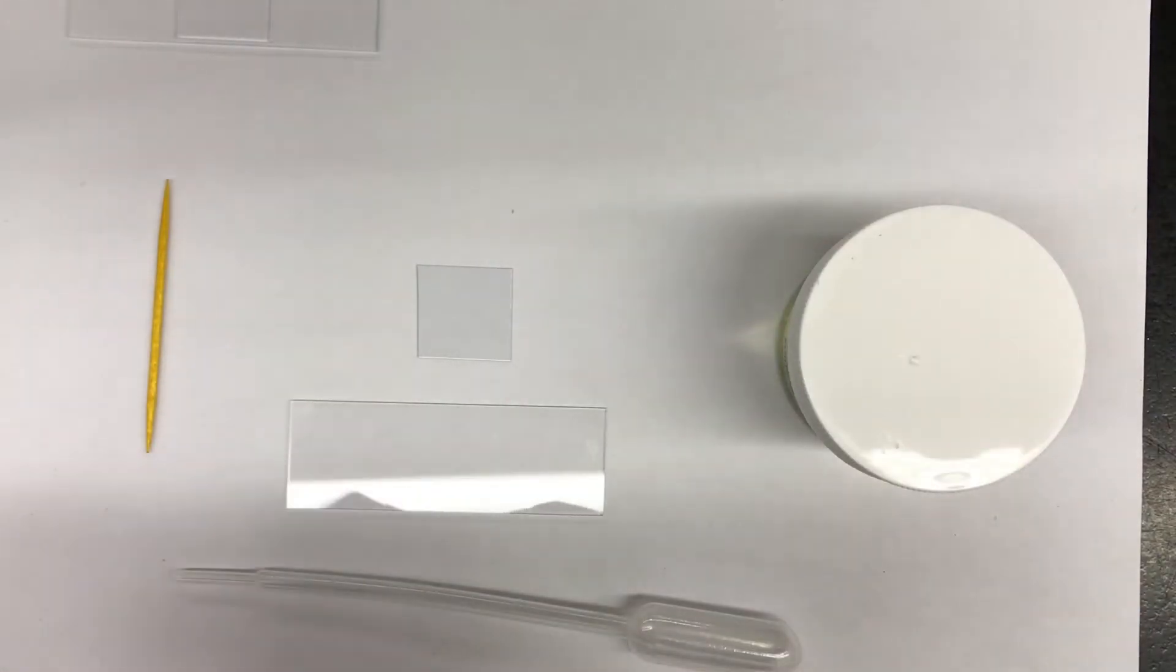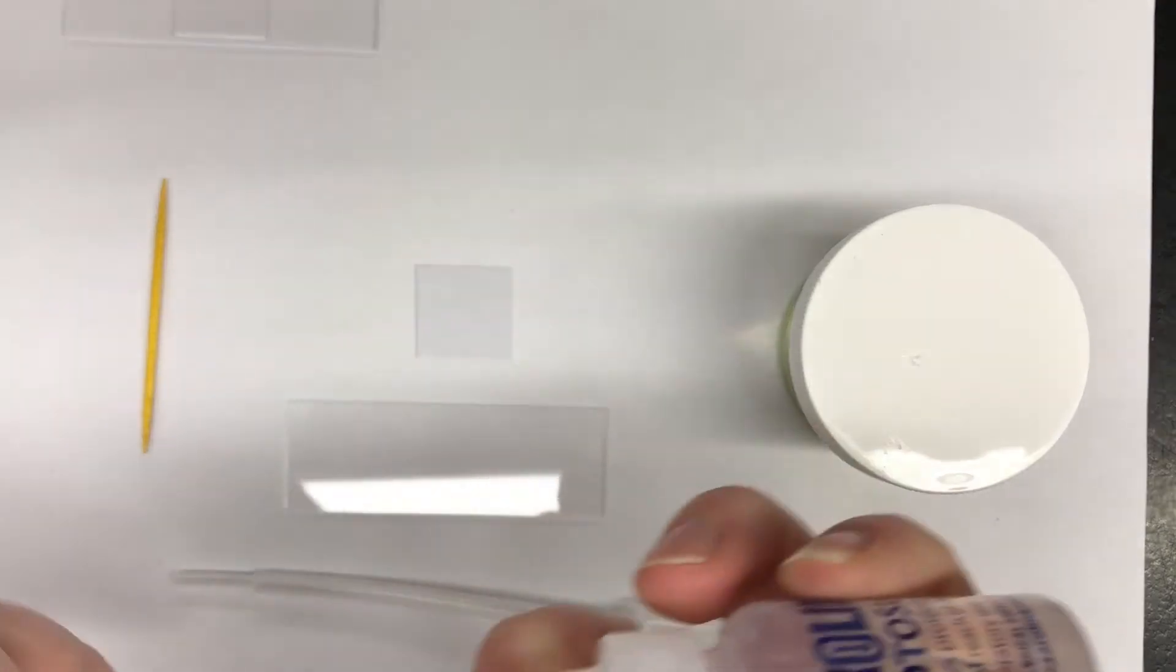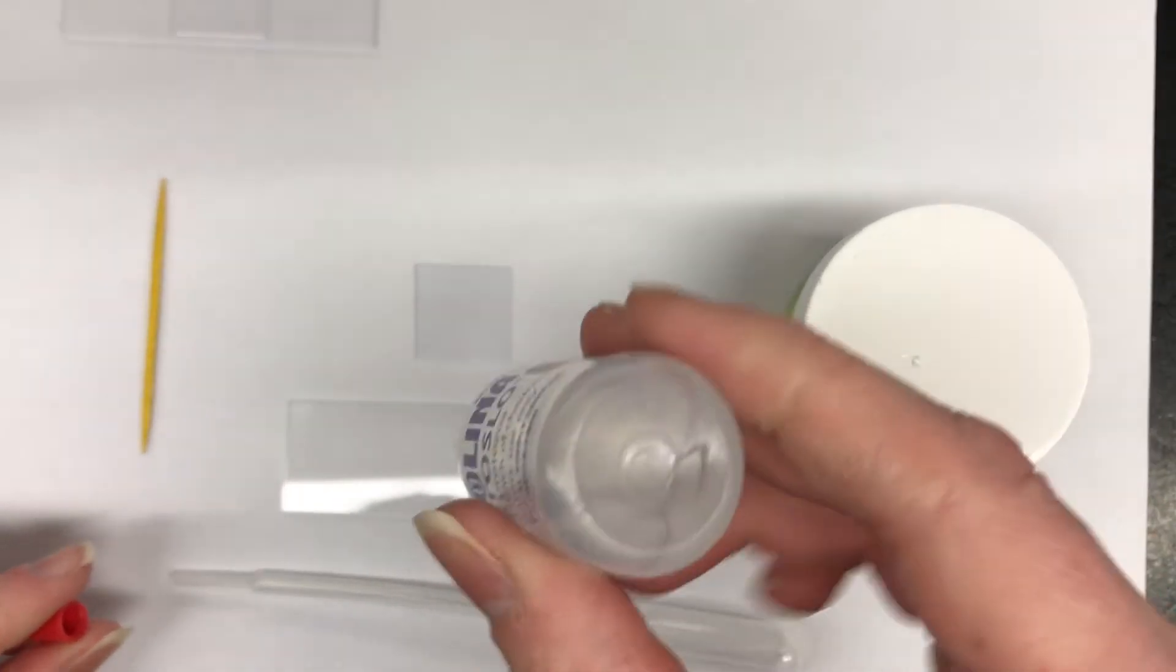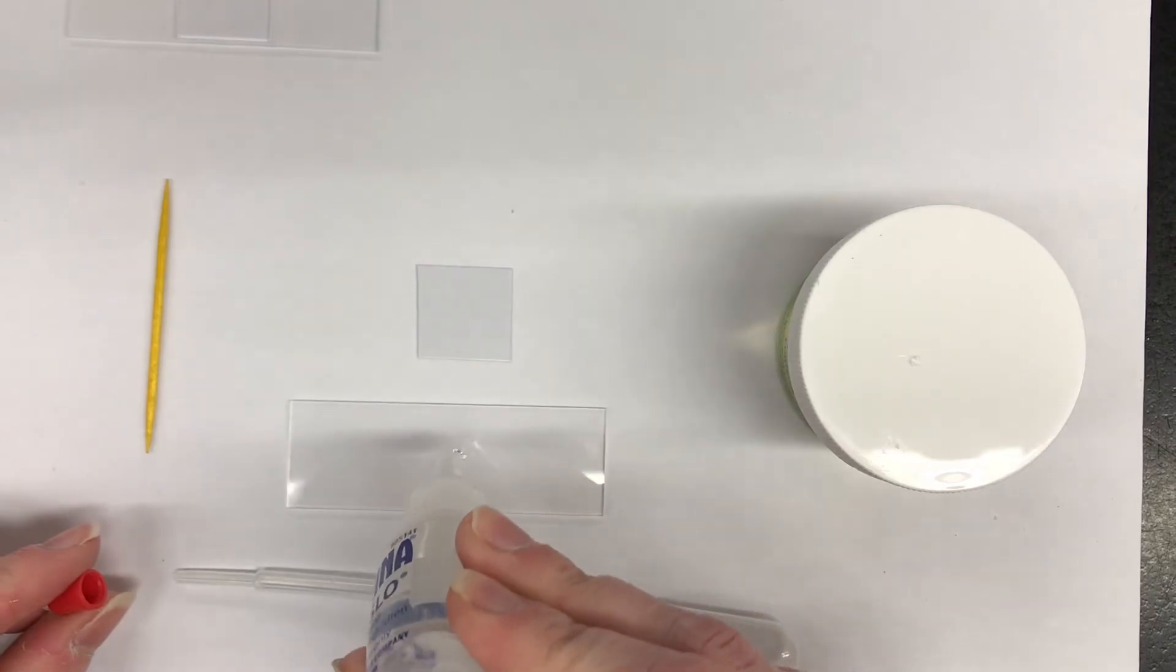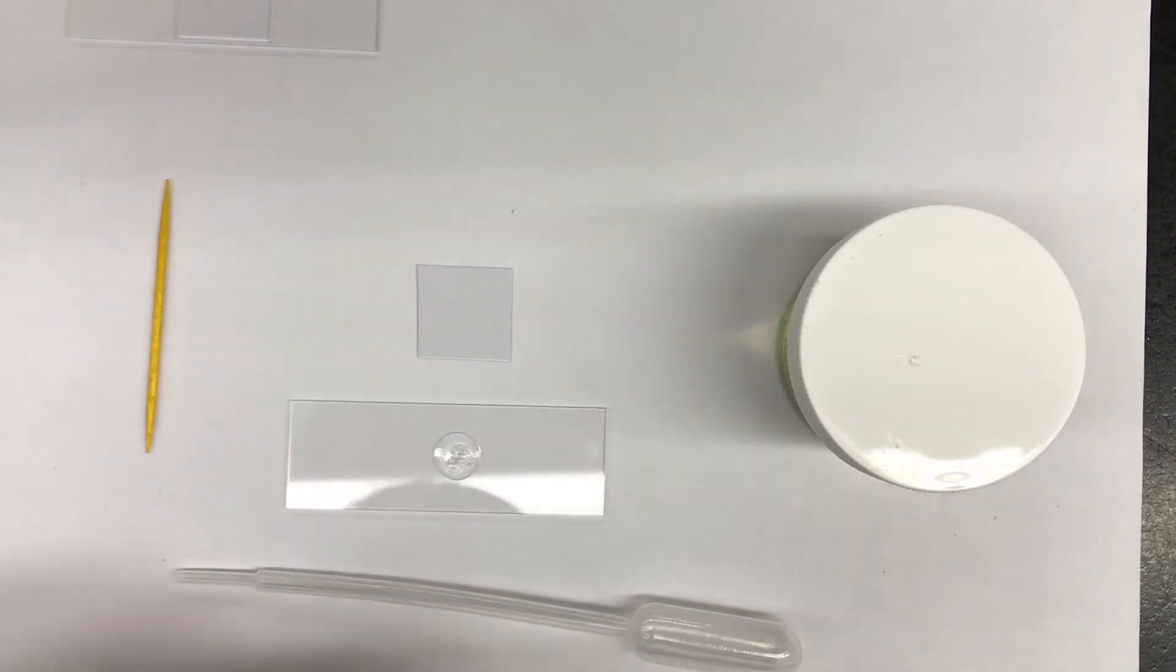Take your protosloe. You're going to invert the bottle and place one drop directly in the center of your slide. Put the cap back on the protosloe.